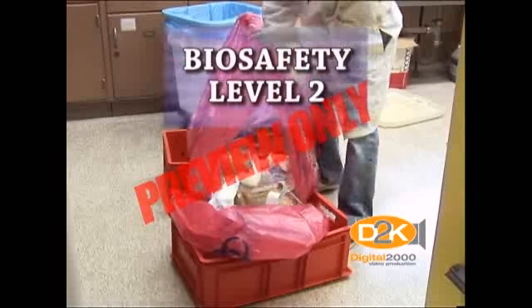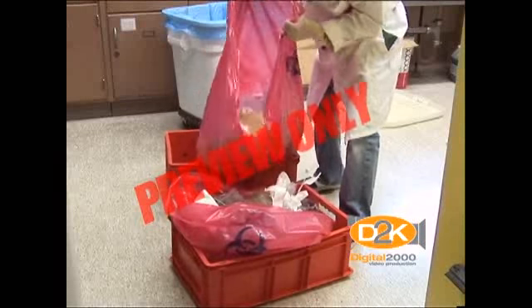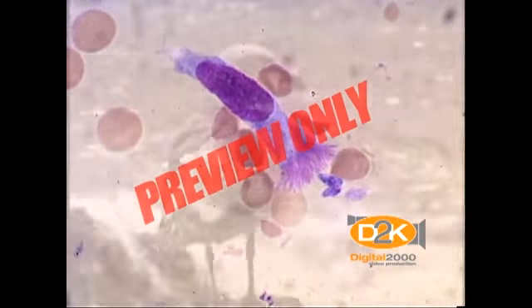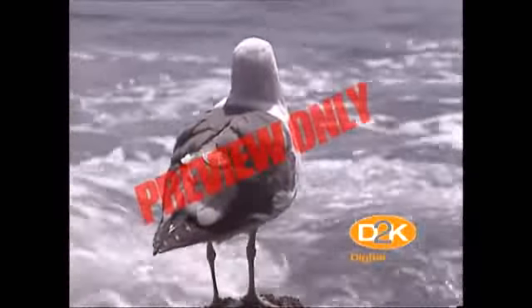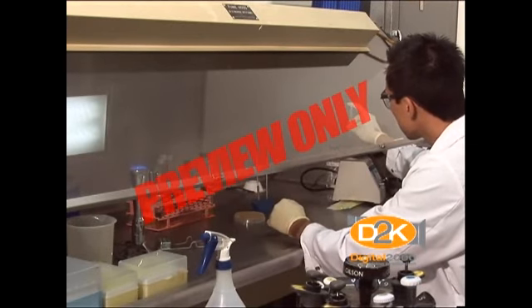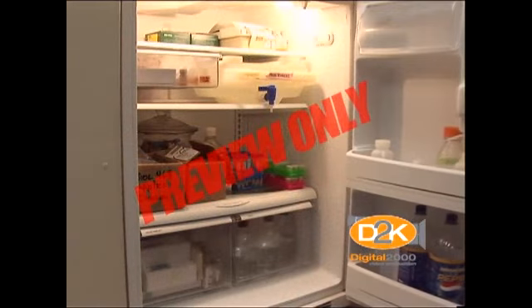Biosafety Level 2 precautions are appropriate for facilities that work with a broad range of indigenous moderate-risk agents known to cause human disease, such as Helicobacter pylori, Salmonella, and Toxoplasma, which is a microscopic protozoan organism that lives as a parasite in the organs of vertebrates, especially birds and mammals. Level 2 precautions are necessary when working with human blood, body fluids, or tissues where the presence of an infectious agent is unknown. The primary hazards associated with Level 2 agents are injection and ingestion.